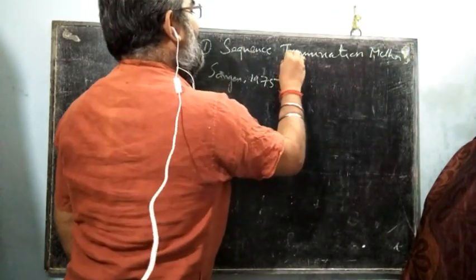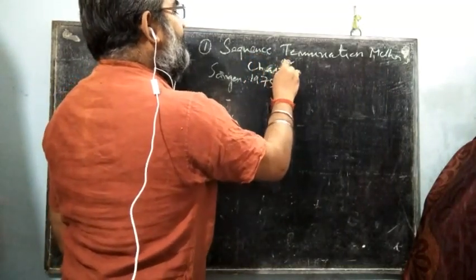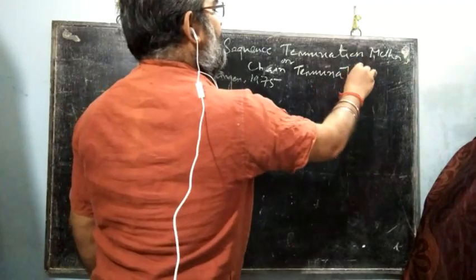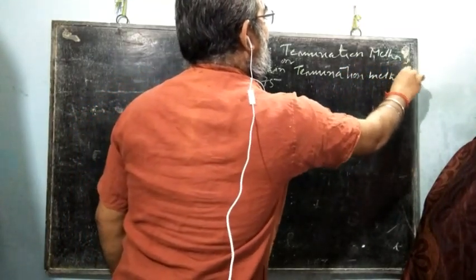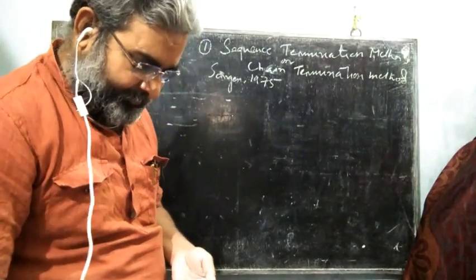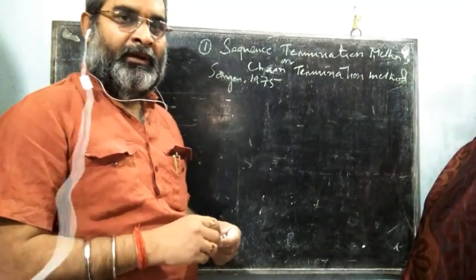Chain termination method. The basic principle of the chain termination method is very simple.